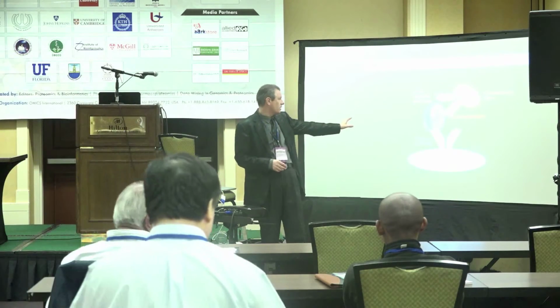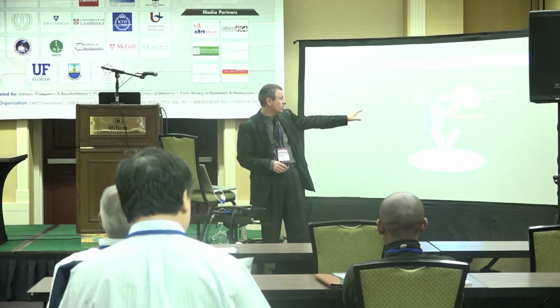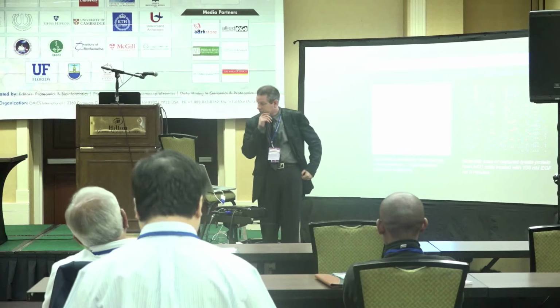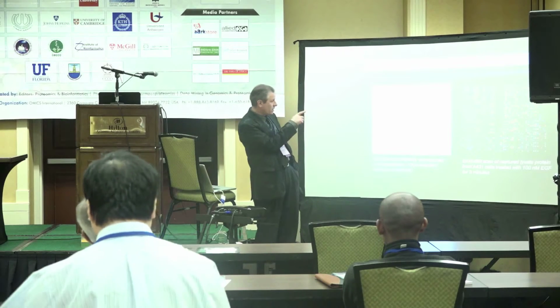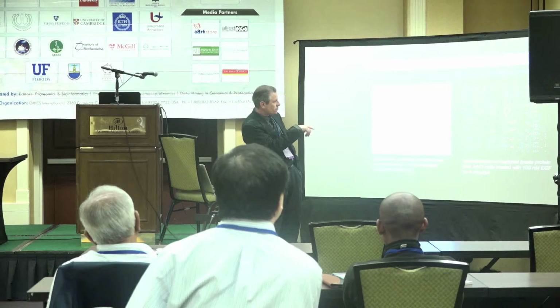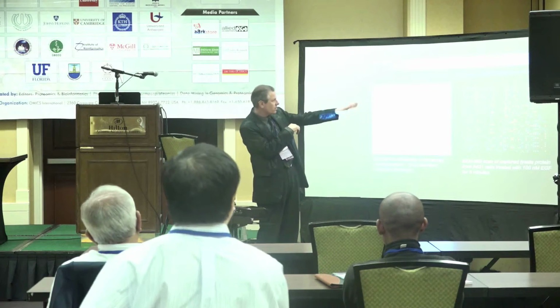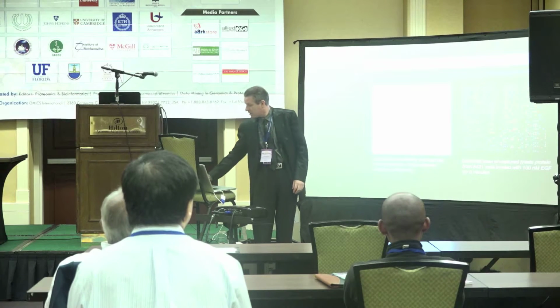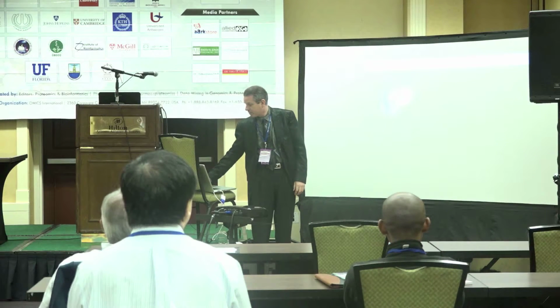We know what protein is captured, so if we see an increase in signal, then it's tyrosine phosphorylated. So here's an example of what a chip looks like for cells that have been treated with EGF. We get lots of signals from tyrosine phosphorylated proteins, and they undergo changes with the EGF treatment.